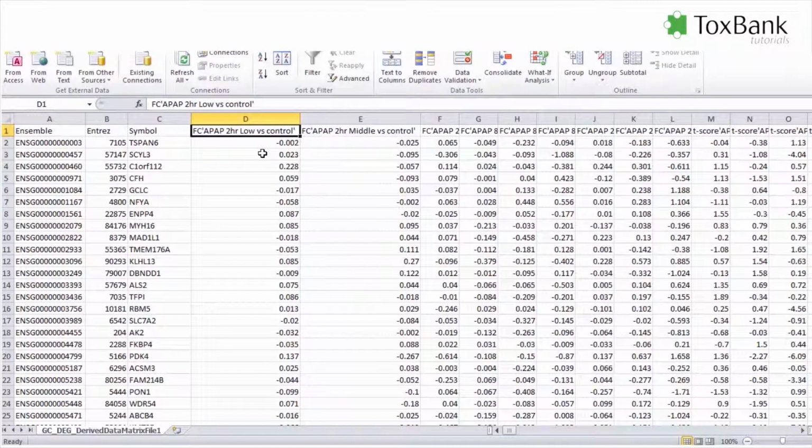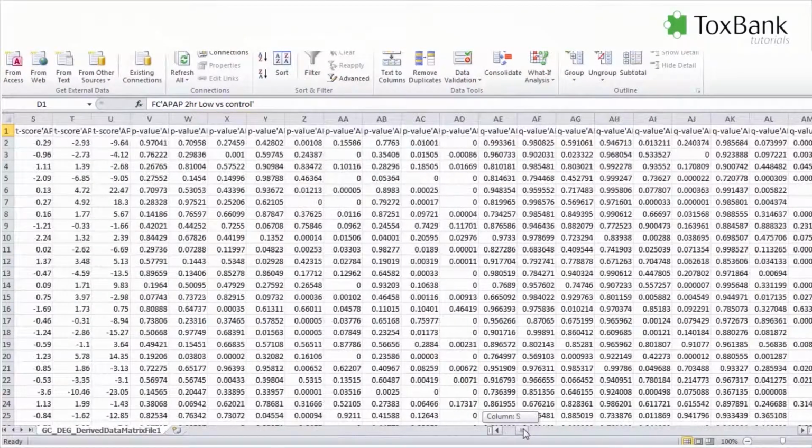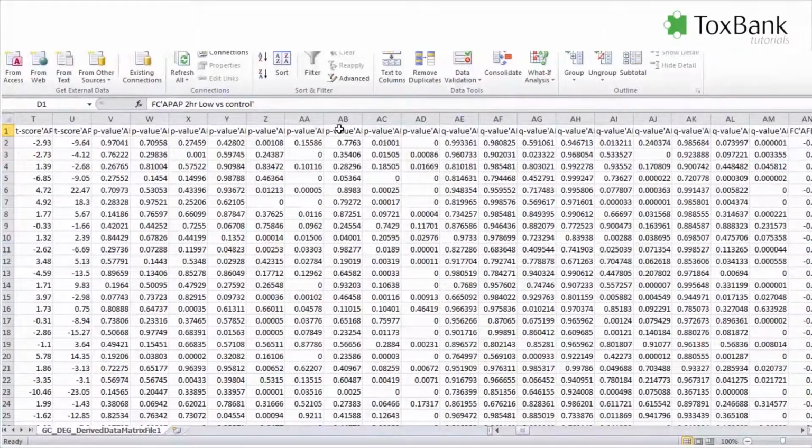However, you can go back to the original data to understand the complete chain of processing that took place, from the experimental design through to the data generation of the CEL files, and the processing of the CEL files to get to this point. So there's a full audit trail of how you got to this data. But this is then information that can be used in an integrated analysis or pathway enrichment, and used to process and understand the data in more detail.